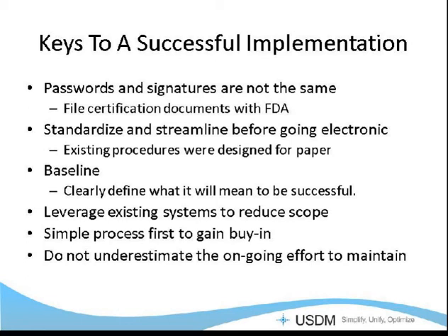A lot of LIMS vendors, for instance, will have additional modules that handle this type of information. I know that one LIMS system that we used in the lab had an inventory control system. We were able to implement that and get rid of a lot of logbooks and Access databases. And also that allowed us to link up with the ELN once we implemented the ELN system.